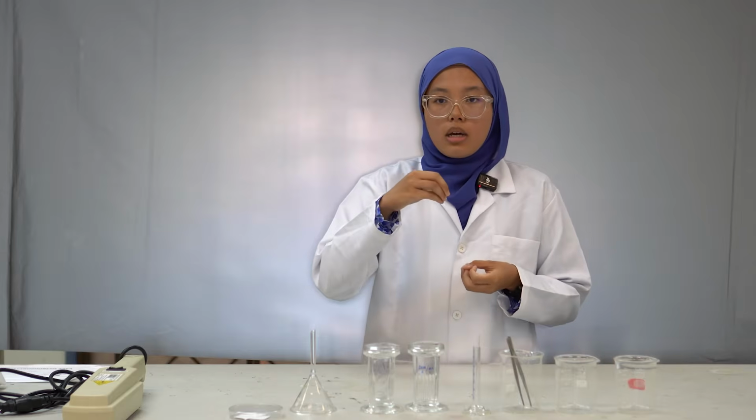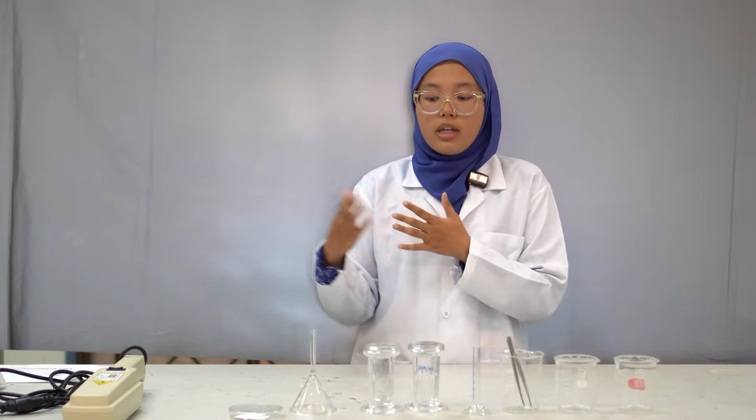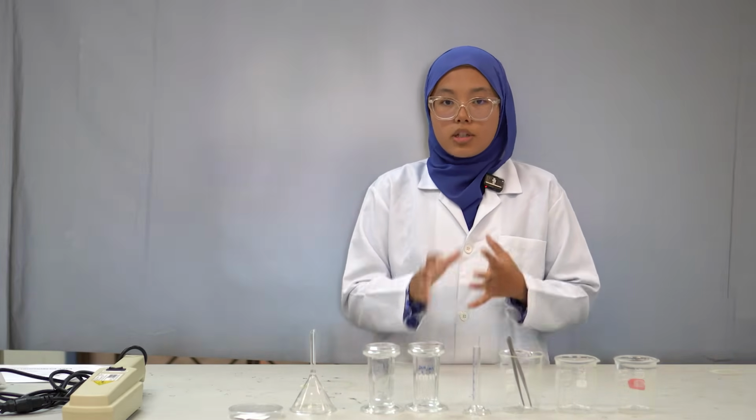Okay, when the solvent mixes with the component, it will rise up as it interacts with the stationary phase, which is the plate, while the mobile phase is the solvent. So it will drag the components along to the solvent front. These components we can determine after the UV ray. In chromatography, we can measure the distance travelled using the RF value.